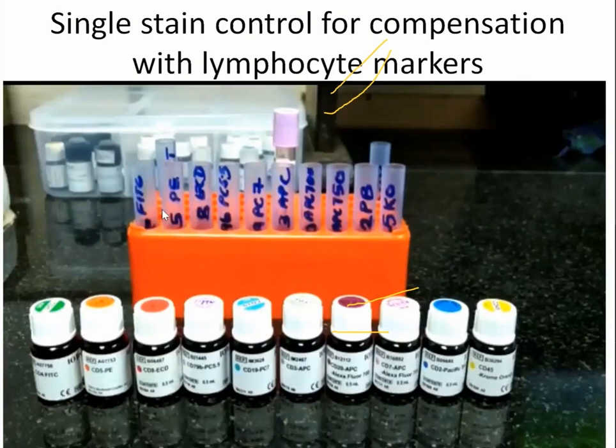Here, what I'm doing is allocating one particular tube for every fluorochrome which is there in my experiment. Starting from FITC, PE, ECD, PC5.5, PC7, APC. And then I'm selecting antibodies which are lymphocyte markers. For example, if you see here, CD4, CD5, CD8, CD79b, CD19, all are lymphocyte specific markers, so that I get a negative control as well as a positive control. So selecting the antibodies or markers is also an important thing. So I have selected cells as my controls and I have also selected the markers.